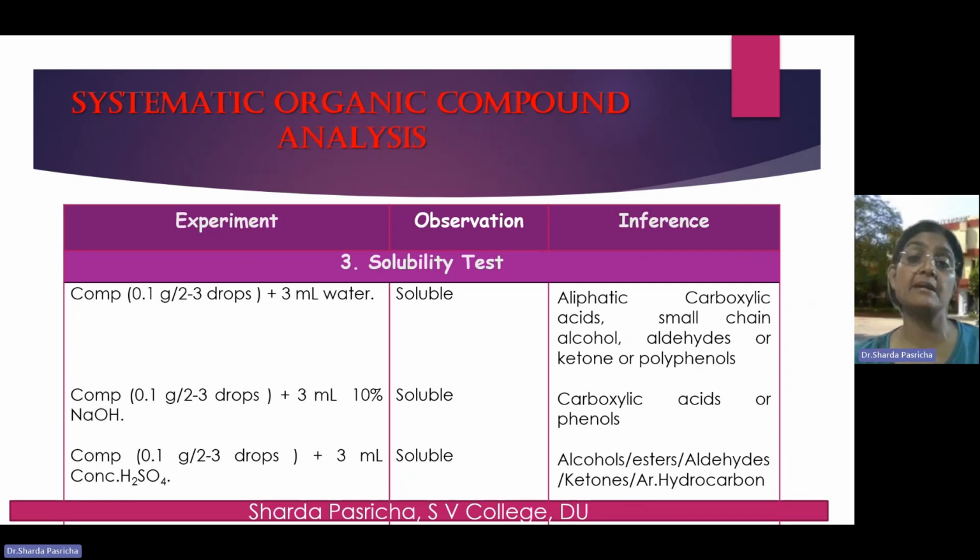If you see the precipitate, or the oil in case your compound initially was liquid, coming out, it indicates that the compound had gone into alkali. If your compound is sodium hydroxide soluble, then you say that the compound is acidic. The acidic functionalities present in your compounds are phenols and carboxylic acids. Okay, so for now, you say that the compound is a phenol.